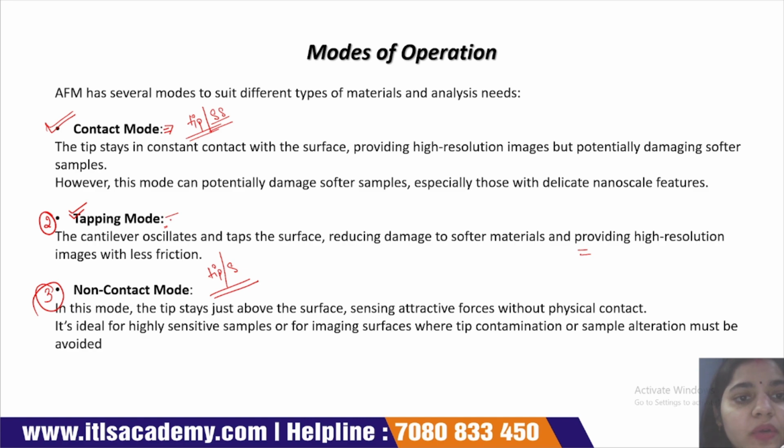But in tapping mode, the tip of the cantilever oscillates on the surface of the sample. But in non-contact mode, there is no physical contact between the tip of the cantilever and the surface of the sample. The tip stays just above the surface, sensing the attractive force without physical contact.